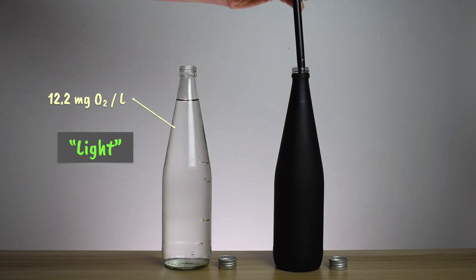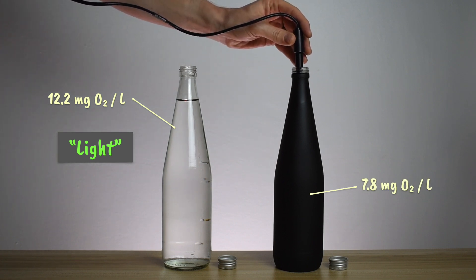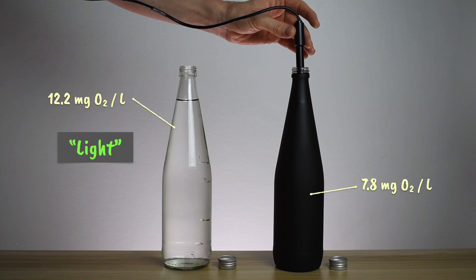Next, do the same for the dark bottle. Here, we've got 7.8 milligrams of oxygen per litre. We'll call this value dark.